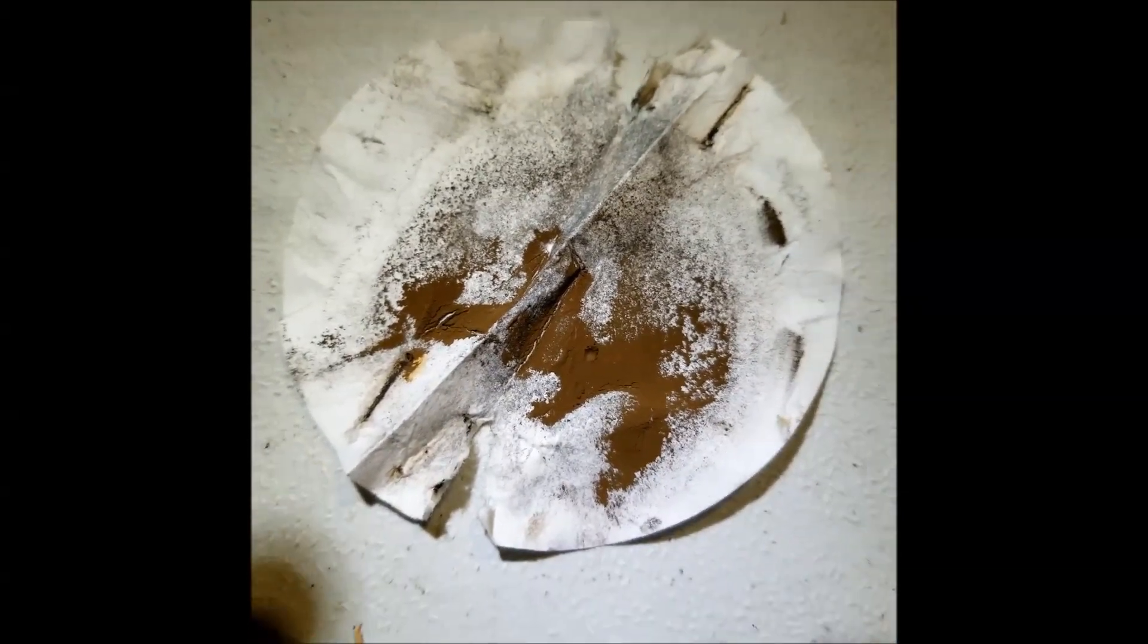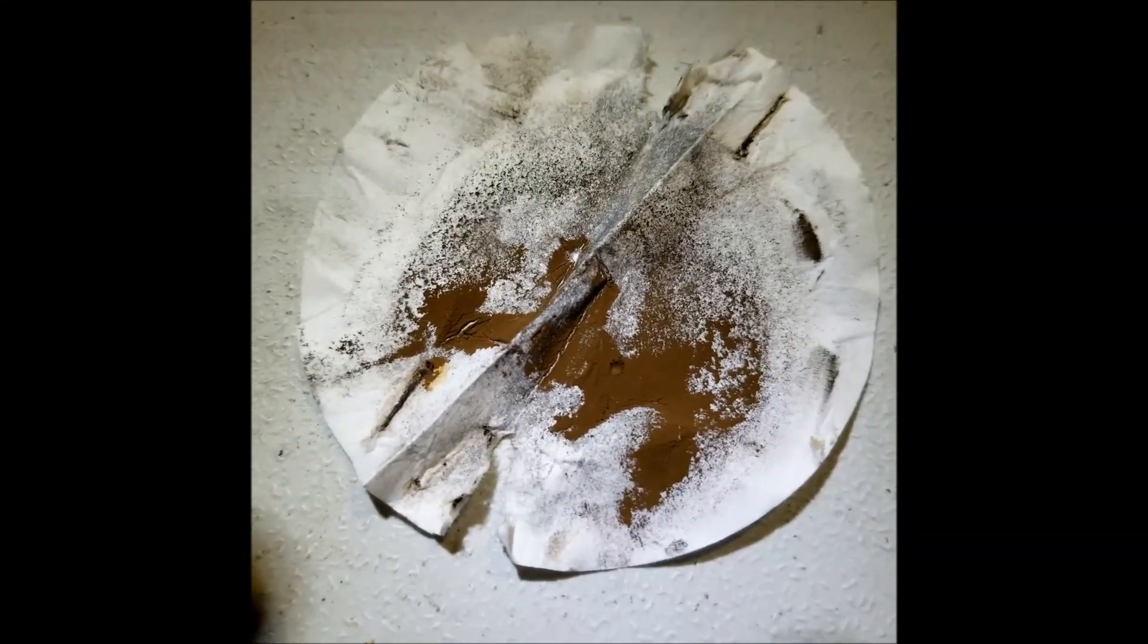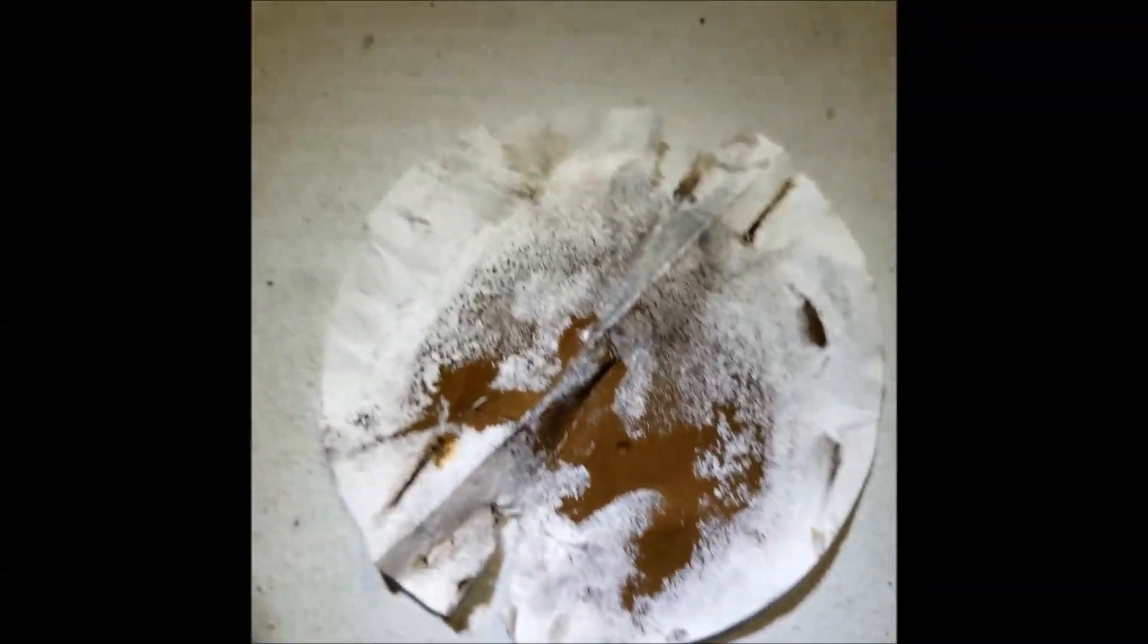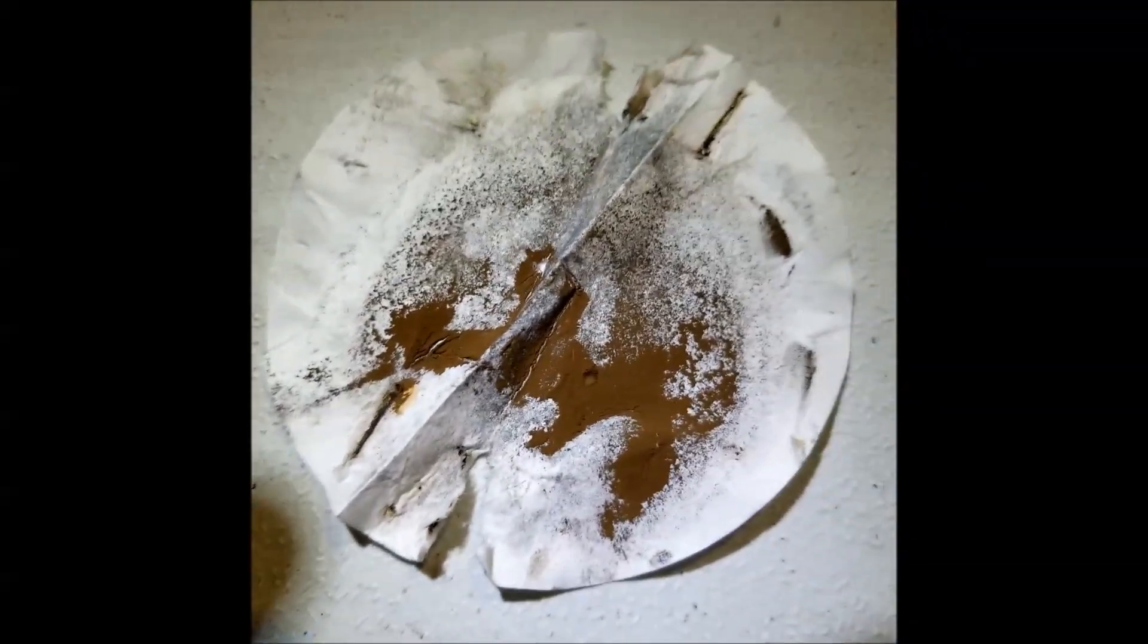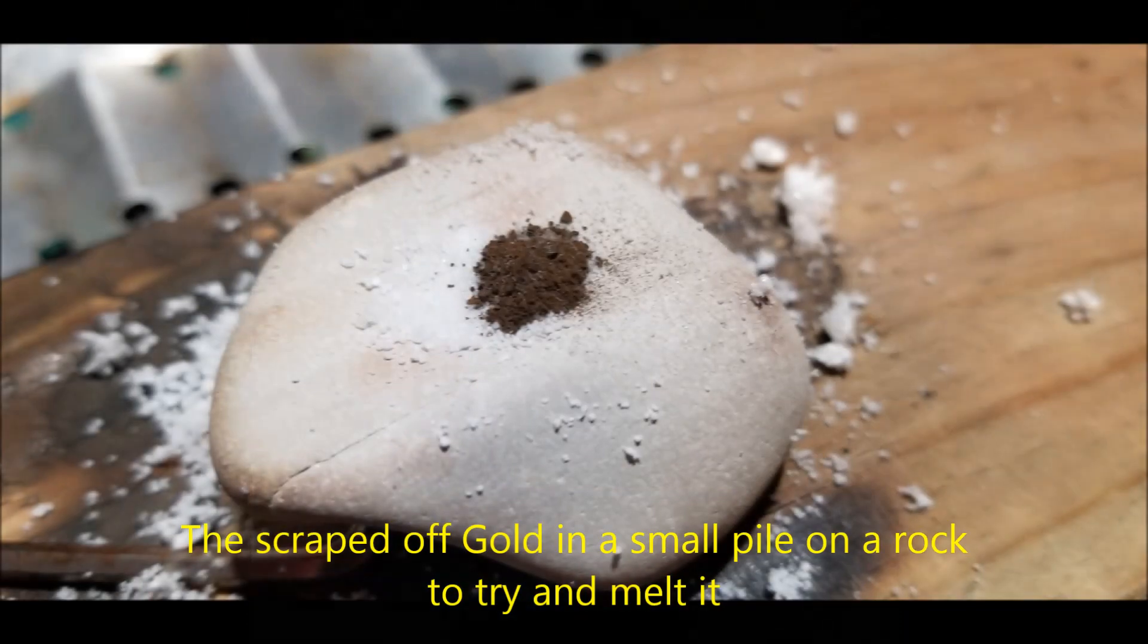This is going to be scraped off and then melted together to make a little gold bead. Interestingly, the mix of the aqua regia and the sodium metabisulfite that we did last melted a hole right through this. Pretty amazing. Strong stuff.